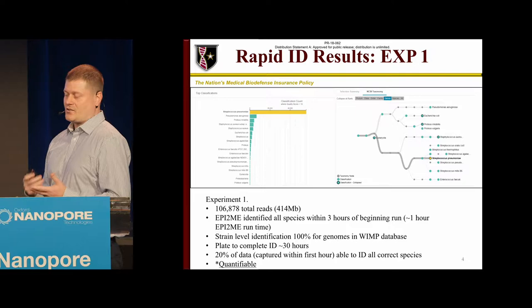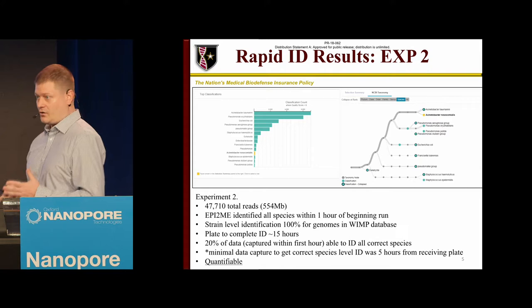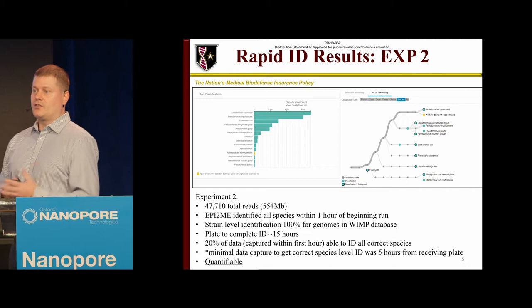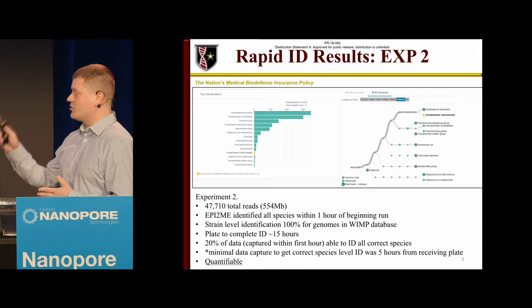Surprisingly, mixing them together without barcoding actually gave us slightly better results using the rapid kit with fewer reads that were far, far longer. And within 1 hour of starting the run, we were able to get species or strain level identification on all of the isolates in the sample. And again, 20% of the data, which came off in probably a few minutes, gave us pretty much the same taxonomic breakdown. And it appears to be quantifiable because these ratios do reflect what we put in.